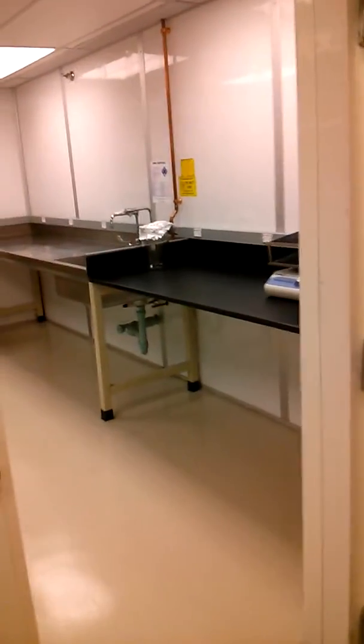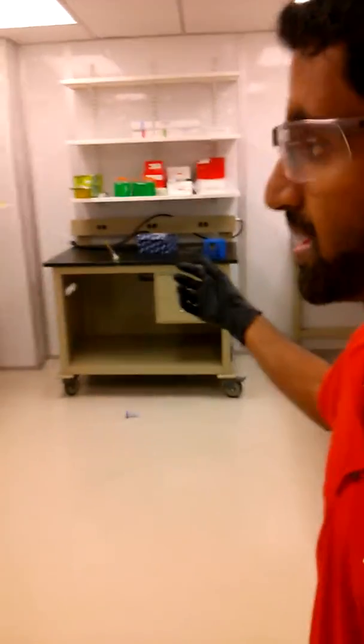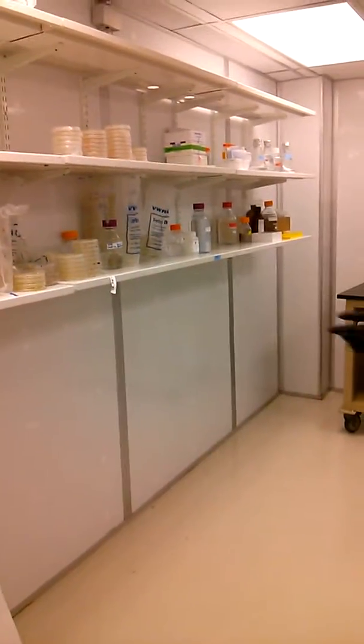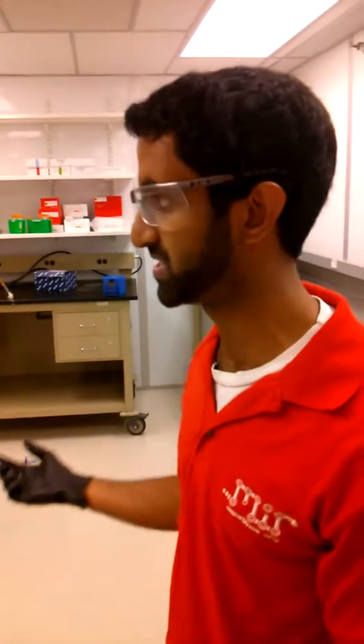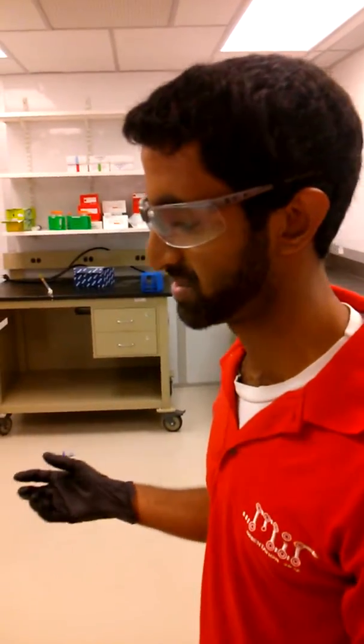This room is at 4 degrees C, and it's all ours, and it's a very large space to be able to store a lot of different plates and buffers, and especially useful for protein purification or other things where you're dealing with things at low temperature. And that's pretty much the cold room. It's always unlocked. That's something useful to know. These other rooms require card access.